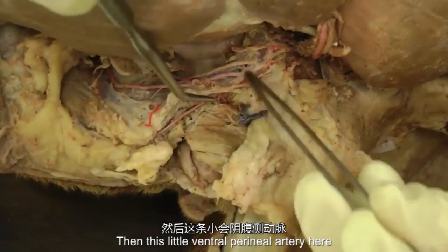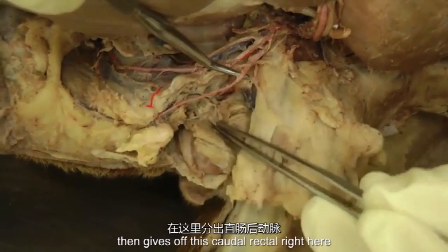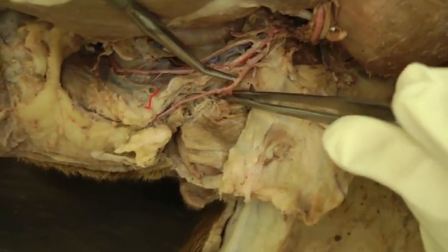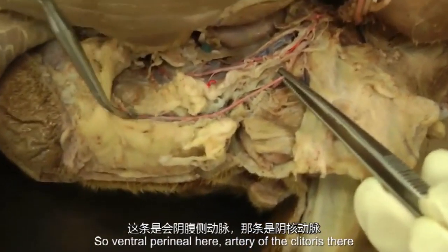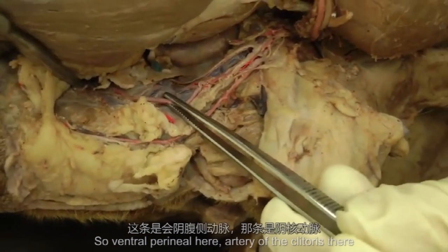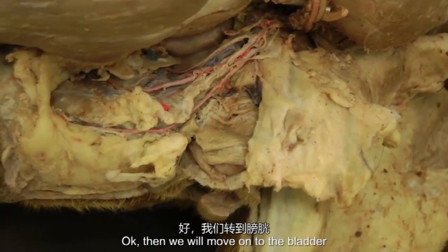Then this little ventral perineal artery here gives off this caudal rectal right here in the forceps, and then we'll continue as a ventral perineal, just going to that perineal region. So going down here, ventral perineal here, artery of the clitoris there. Okay, then we'll move on to the bladder.